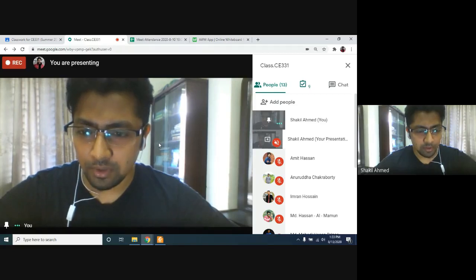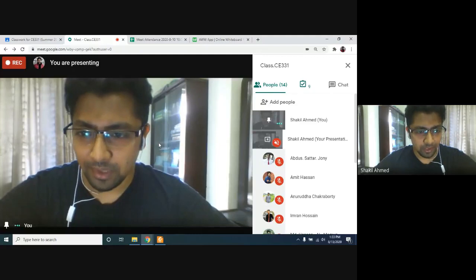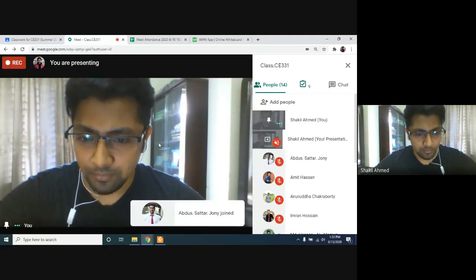Afternoon, everyone. Welcome to the class of CE331 Environmental Engineering 1 lab. So, today we will perform the test to determine the chemical oxygen demand that we call COD in water.